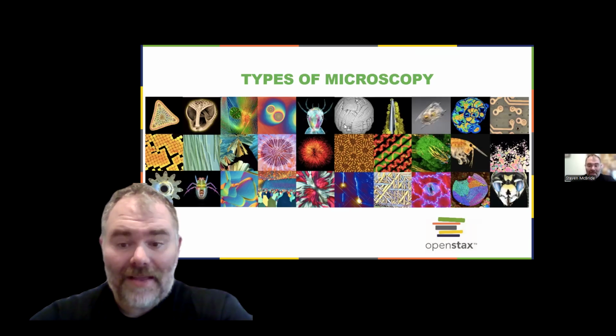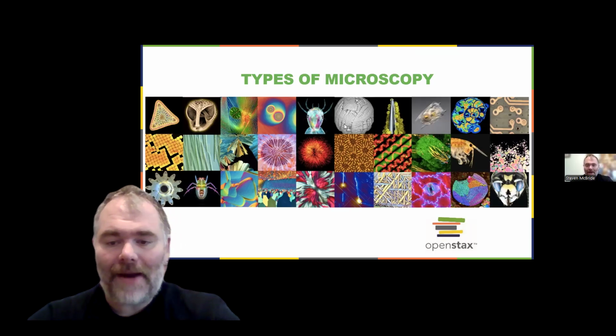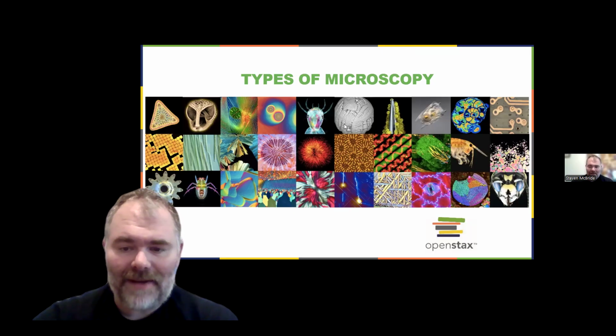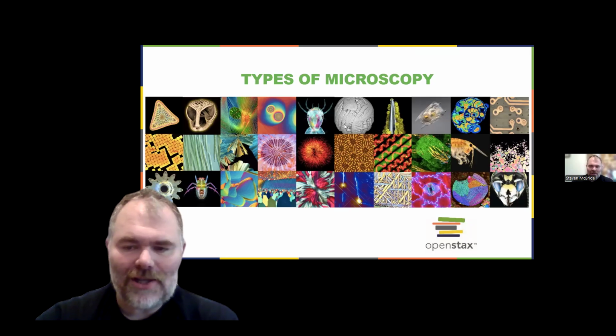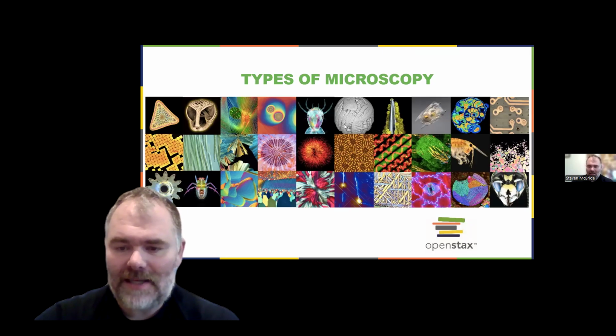Hi, everyone. In the last lecture, we explored how light microscopes work and why magnification and resolution are important. We learned that simply making an image larger is not enough. Scientists also need enough resolution to distinguish small structures and separate objects. But different microorganisms and cellular structures create very different imaging challenges.